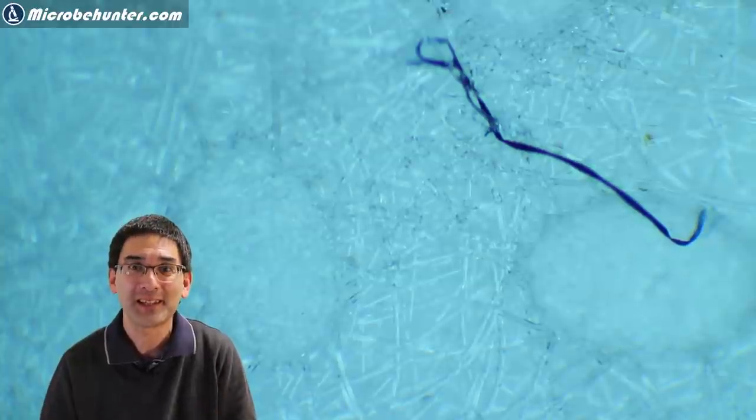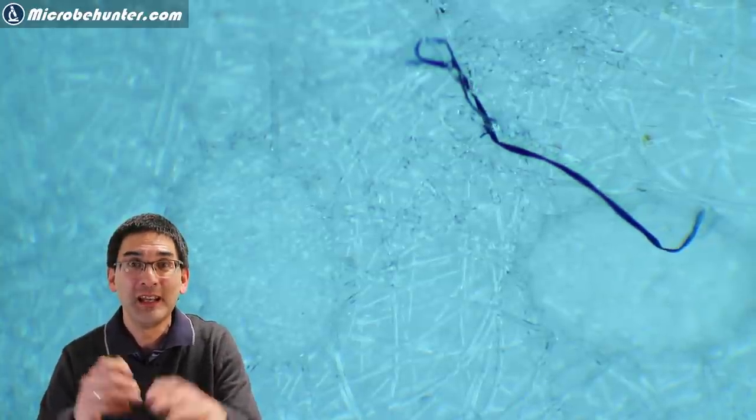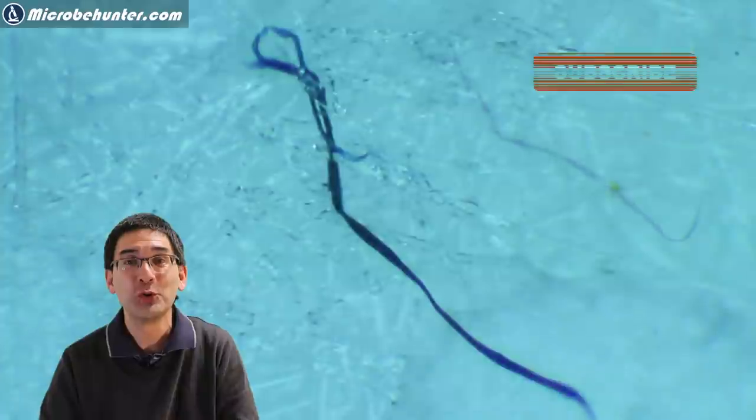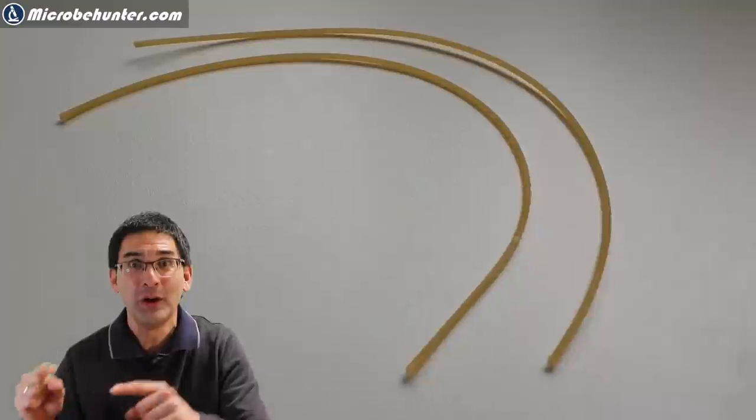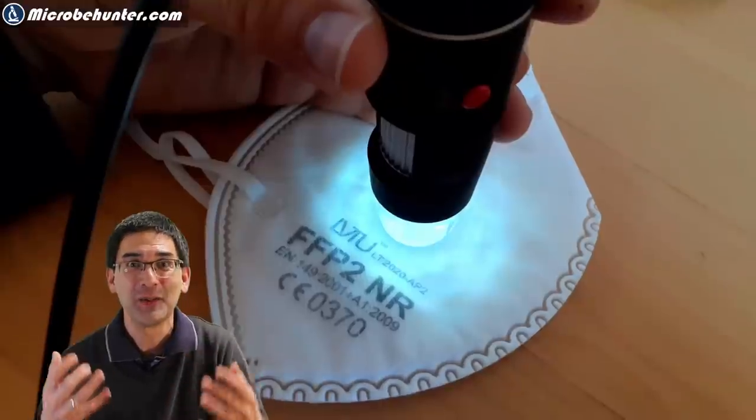These are normal textile fibers from clothing and in this video I'm going to show you how you can isolate them and how you can make them move. At the end of the video I'm also going to show you how you can make those spaghetti noodles move because the physics behind it is actually quite similar.